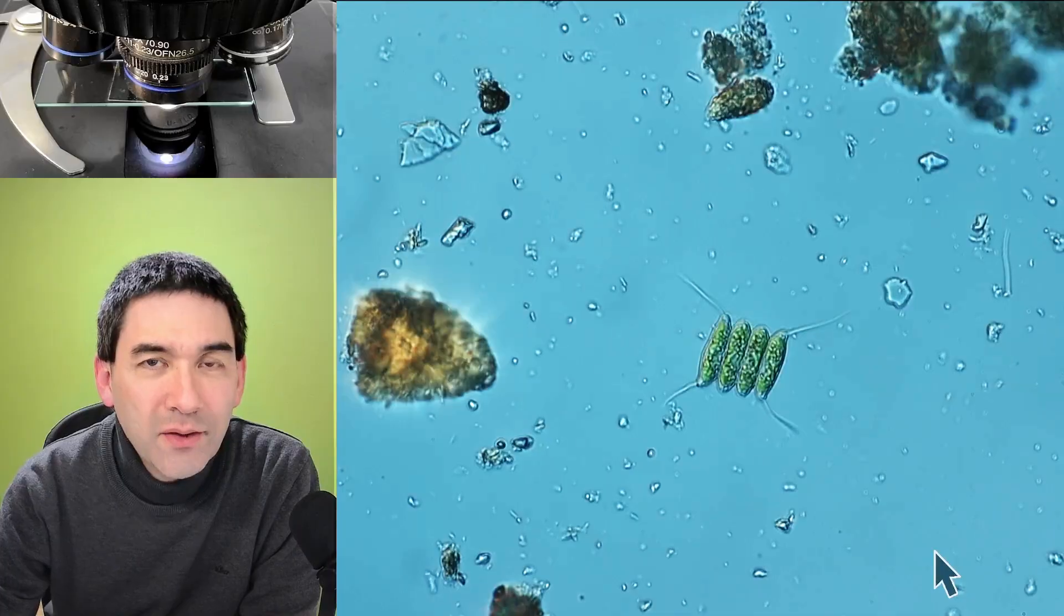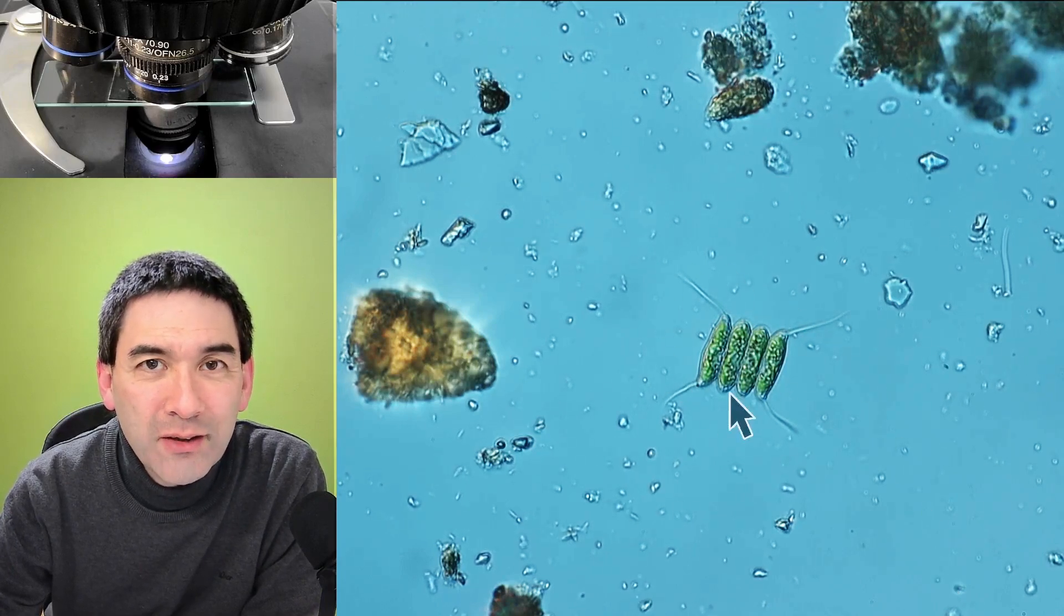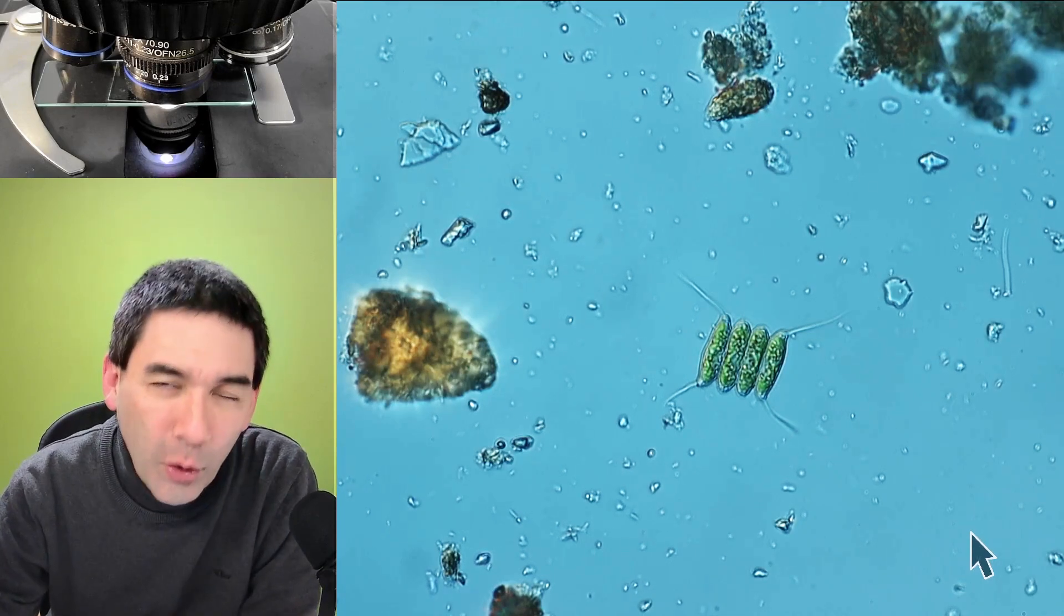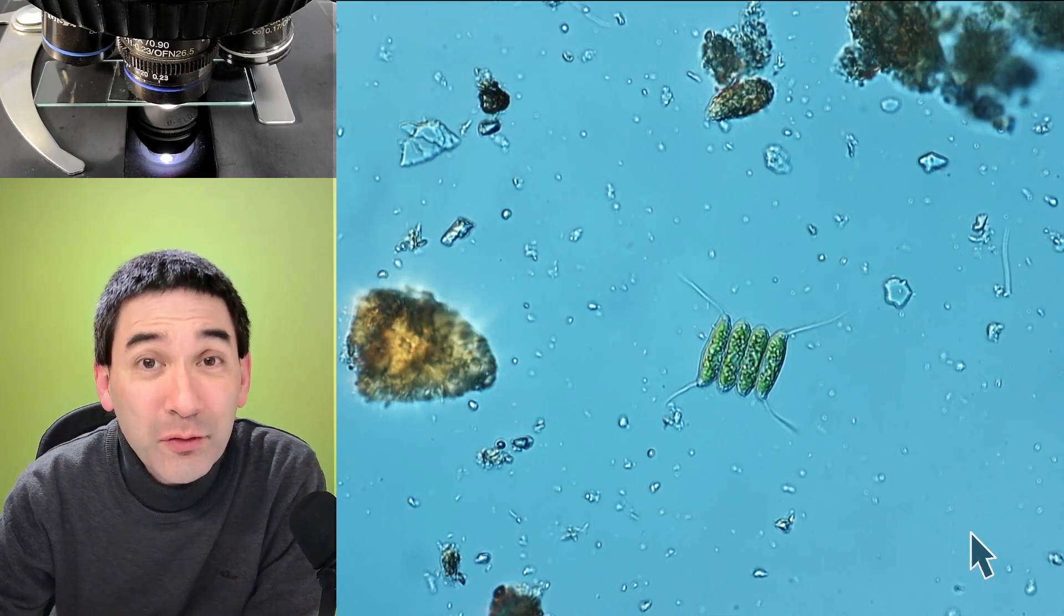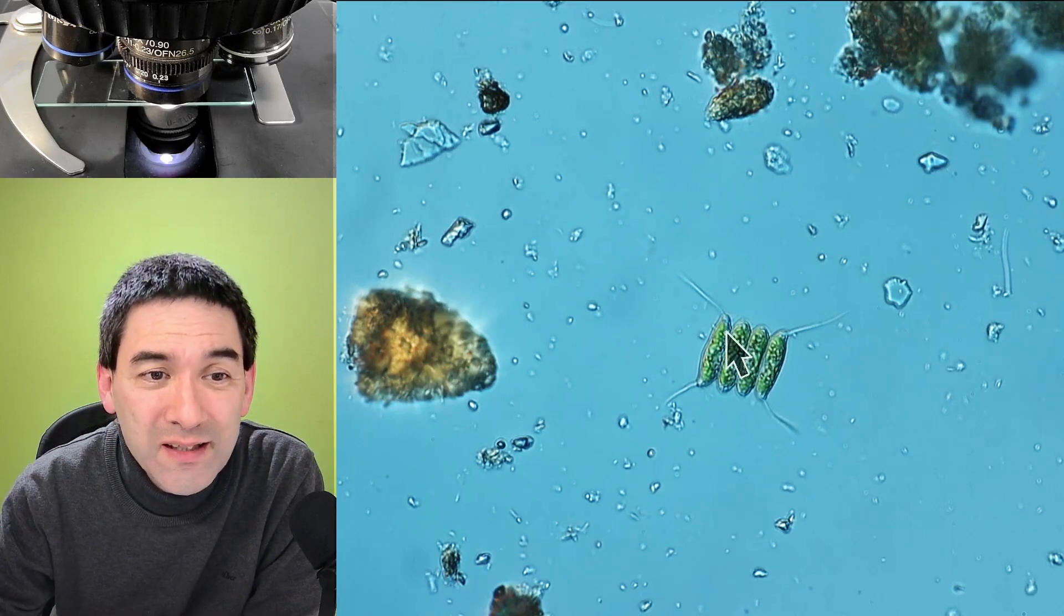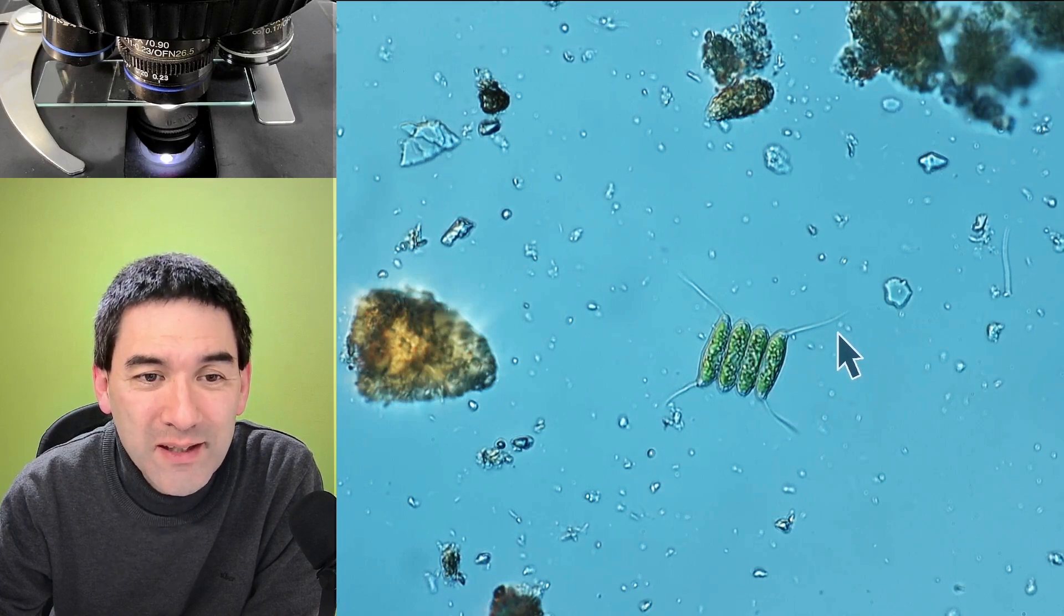So the name of this algae here, it's a green algae, the name is desmodesmus. It's a fairly common observation. For whatever reason they always appear in groups of four and the two outermost cells they always have these long extensions here. Quite nice that I was able to find them also here.